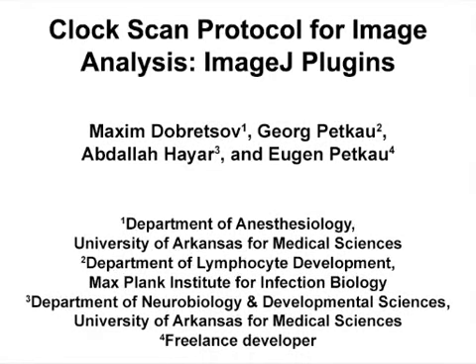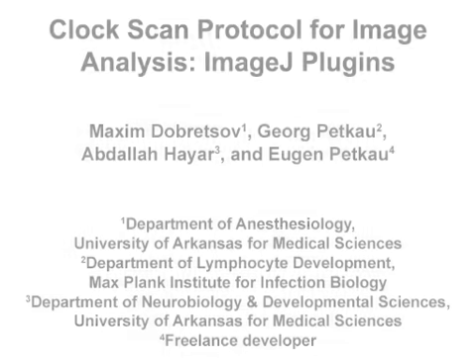The overall goal of these clock scan protocols is to allow the fast characterization of the average pixel intensity within, along the border of, and/or on the outside of selected regions of interest. This method can help answer key questions in tissue image analysis about the average pixel intensity within specific regions of interest. The main advantages of the clock scan technique are that it can be used to quickly characterize the average pixel intensity from or between single or multiple regions of interest.